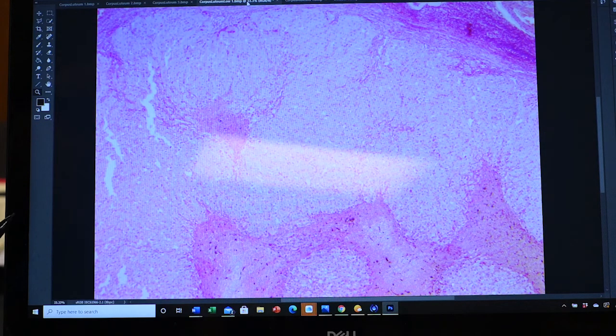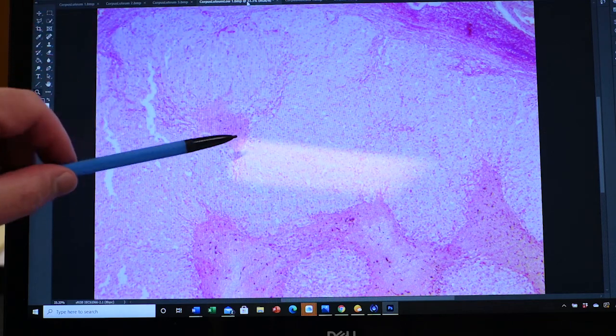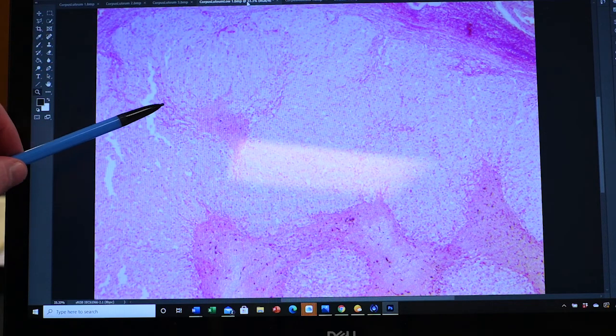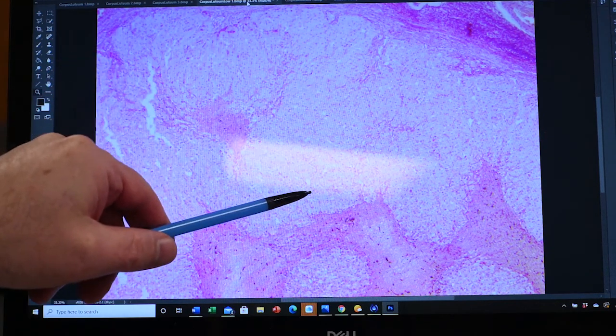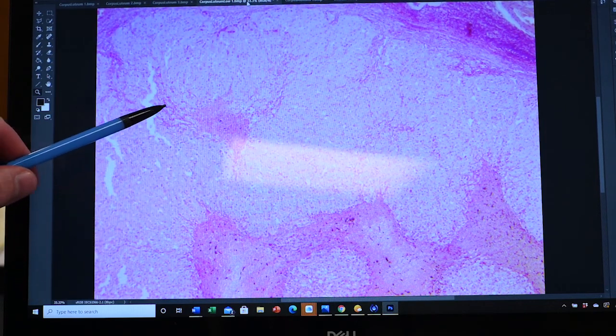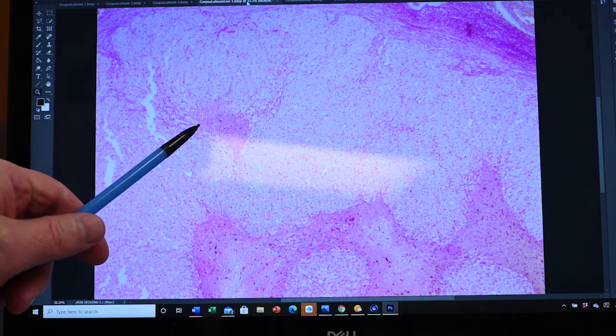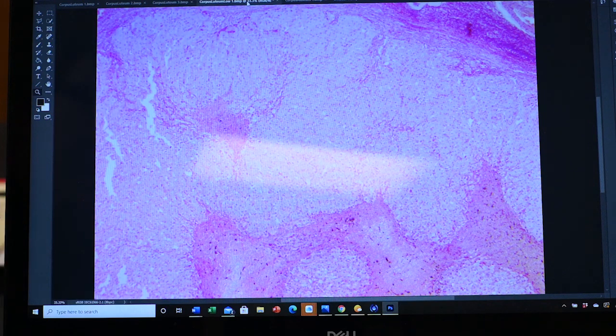This is low magnification of that same structure looking at the corpus luteum. So you can see most of this has that pale look to it. There are bits of the darker cells, the smaller cells from theca lutein. So most of this is granulosa lutein cells. And you can see these little lines going through here, lines set up by that material of the theca externa, more of a structural material than a secretory material.